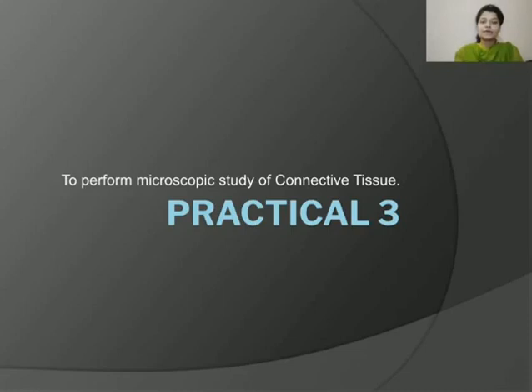Hello students, welcome to the third practical of human anatomy and physiology, and in today's practical we will be studying about connective tissue. The aim of today's practical is to perform microscopic examination or microscopic study of connective tissue.